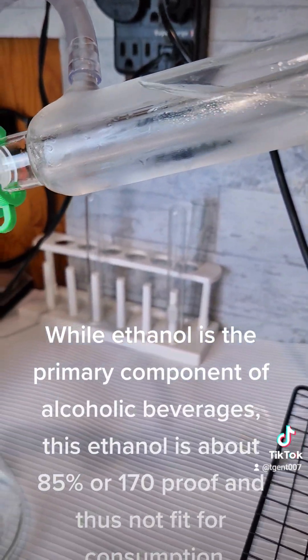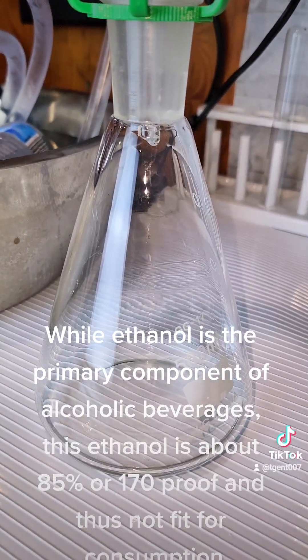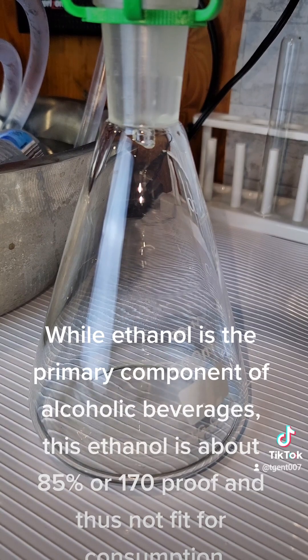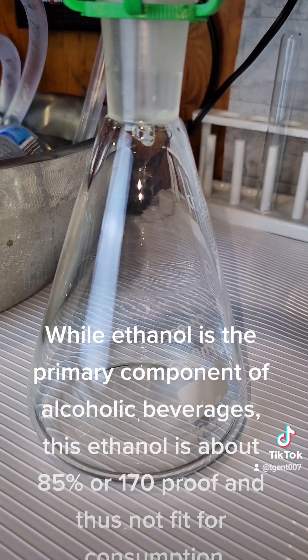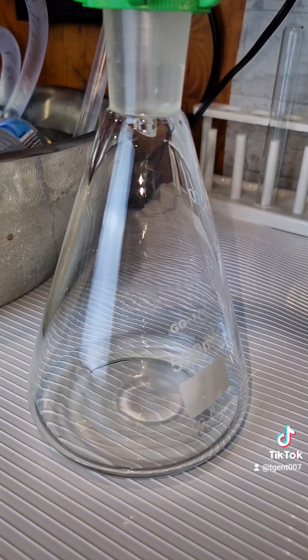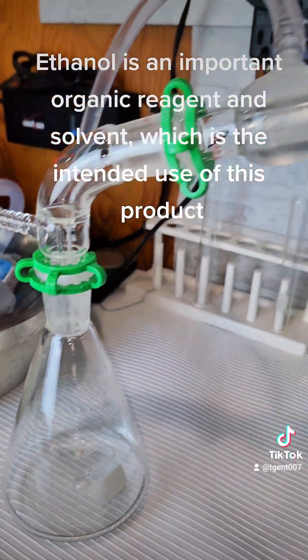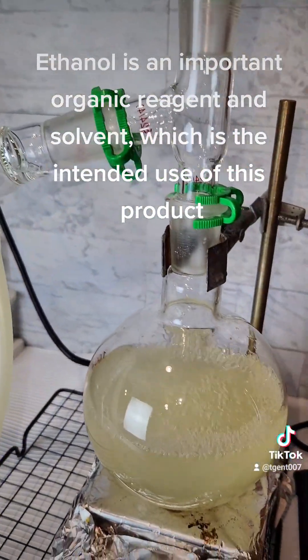While ethanol is the primary component of alcoholic beverages, this ethanol is about 85% or 170 proof and thus not fit for consumption. Typical liquor is 90 proof or 45% strength. Ethanol is an important organic reagent and solvent, which is the intended use of this product.